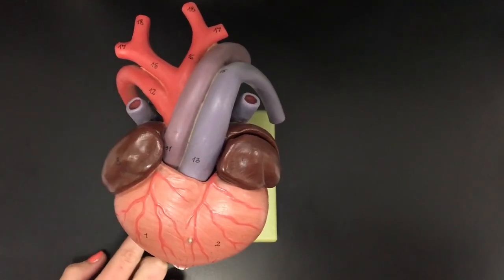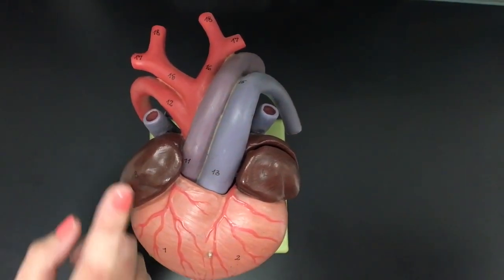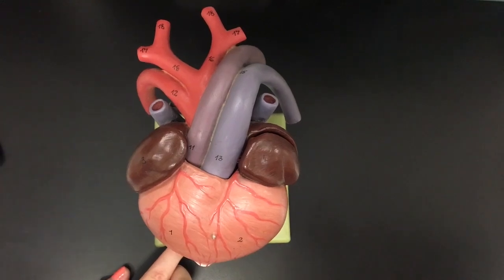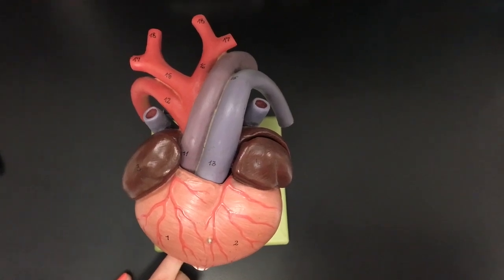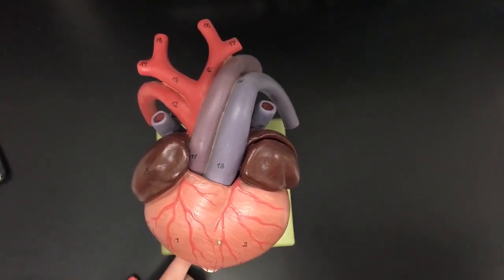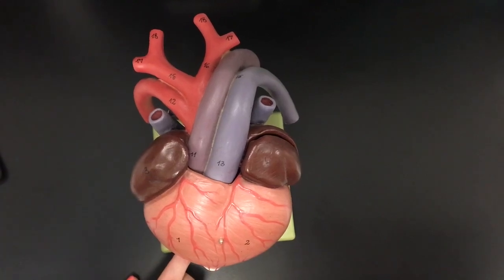This is a turtle heart. Turtle hearts are three-chambered: the left atrium, the right atrium, and the single ventricle. Reptiles possess a hepatic portal system which supplies blood to the liver by the hepatic portal vein, and they have the renal portal vein which supplies blood to the kidneys via the renal arteries. Reptiles also have a double circulatory system consisting of the systemic circulation and the pulmonary circuit — the systemic circuit supplies blood to the body and the pulmonary circuit supplies blood to the lungs.